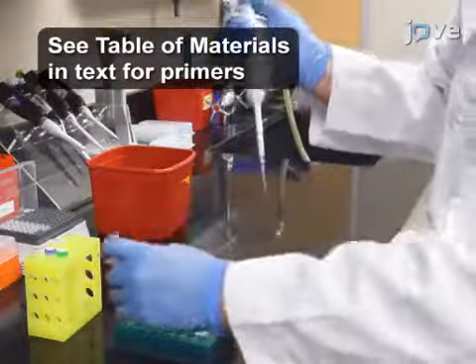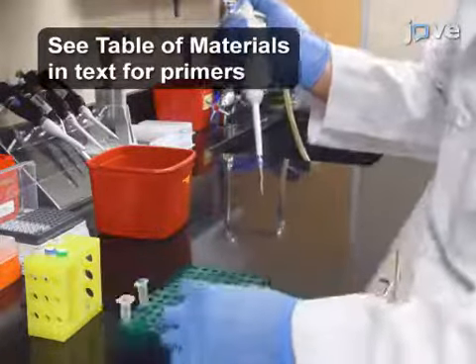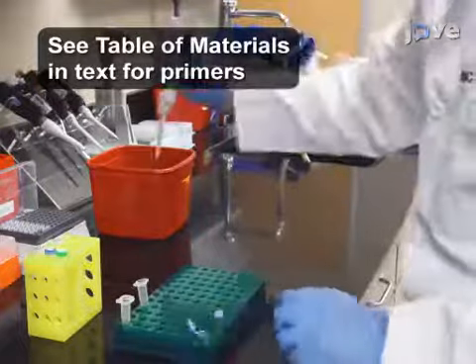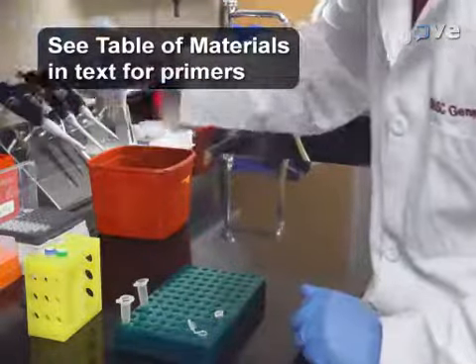Use 500 microliter centrifuge tubes to dilute one microgram of each wild-type and mutant genomic DNA with double distilled water to a final volume of 20 microliters.